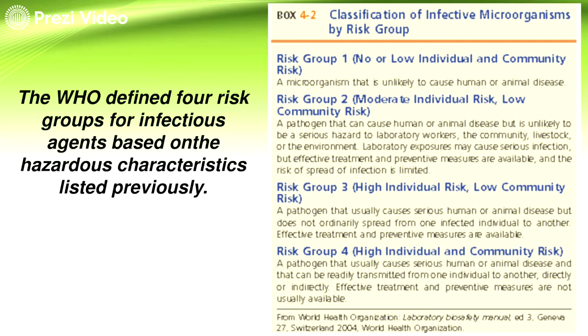Okay, so avoidable siya. Yung risk group 3 naman, risk group 4, so ito yung talagang nagkukos ng sakit. But yes, makakasakit ka talaga. Anong kanilang difference? Yung risk group 3, may available na gamot and preventive measures. Yung risk group 4, wala. So, going to risk group 3 muna, so it means you're going to get the infection. However, the chances of spreading the infection to another is actually very low. So, hindi ka nakakahawa. Ikaw lang yung makakasakit. Kapag nagkasakit ka, ikaw lang. So, makakahawa ka ba? Unlikely.